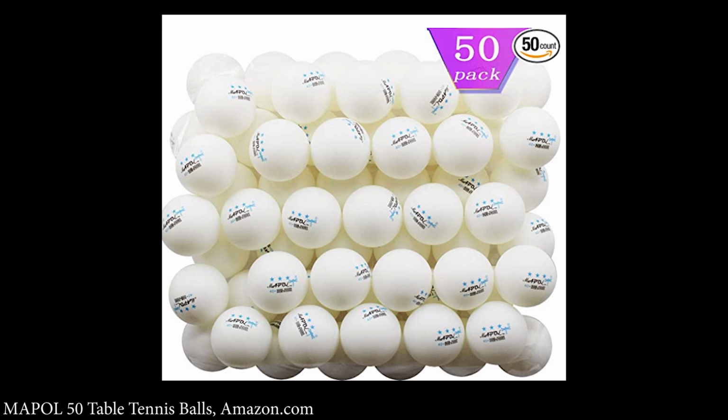So as these particles that are packing the column get smaller and smaller, the molecules are going to have more contact with more particles more often. And that's going to reduce the problems caused by them not having time to equilibrate, because they're going to have a lot more opportunities to interact with the column. So it significantly reduces the C term as you decrease particle size.